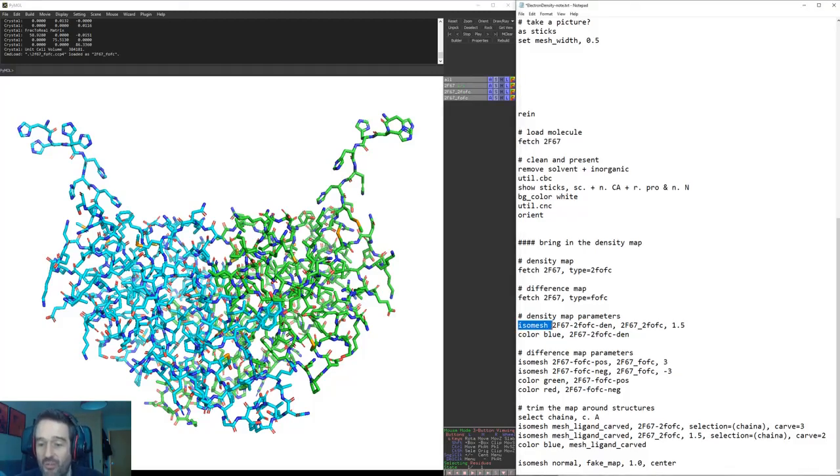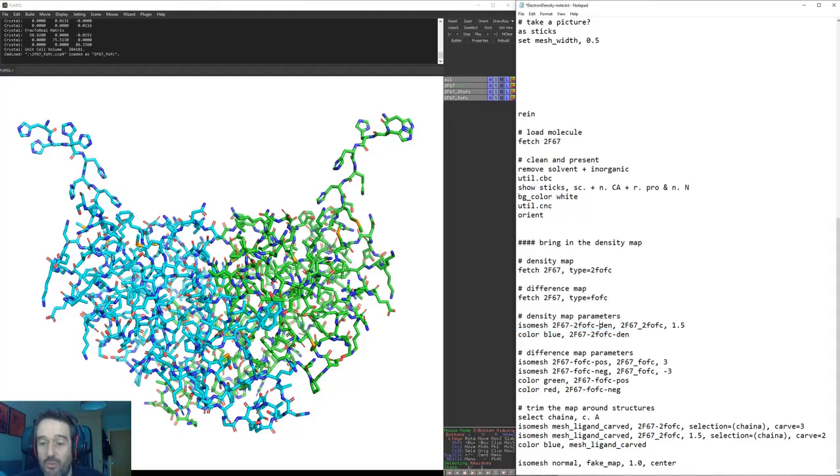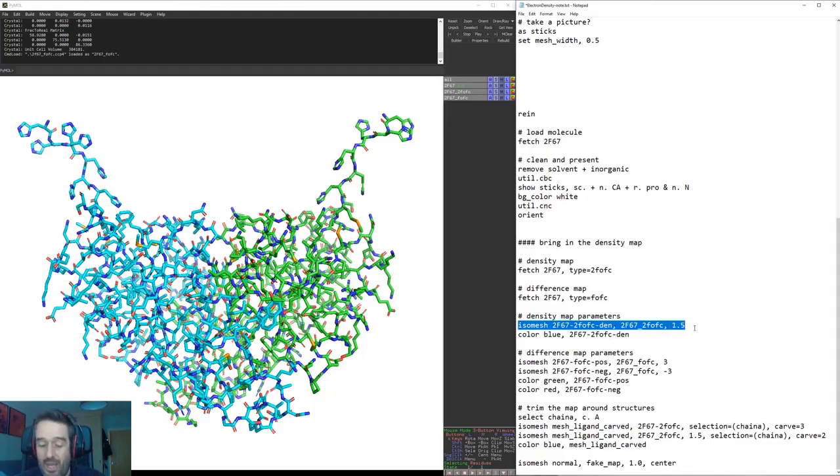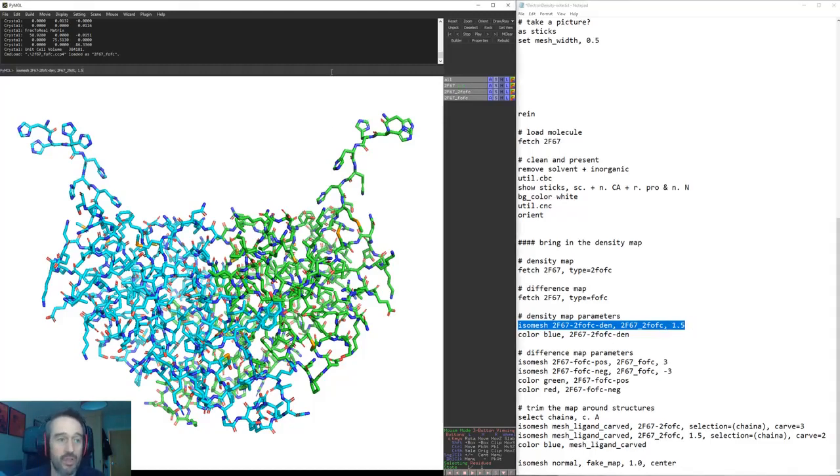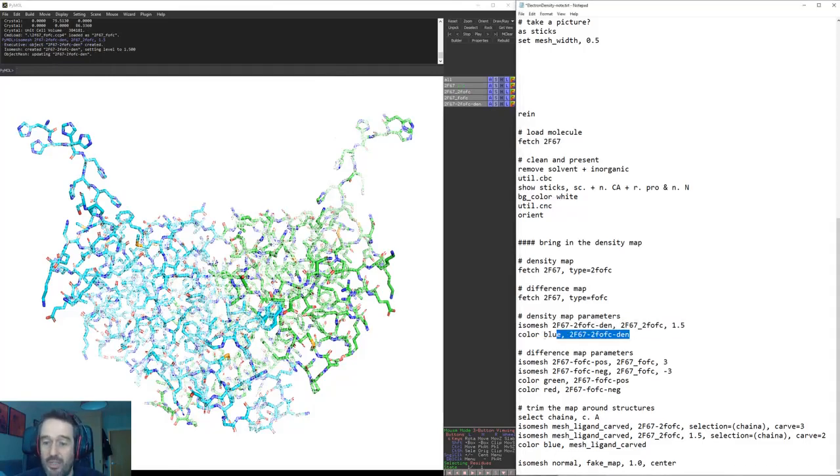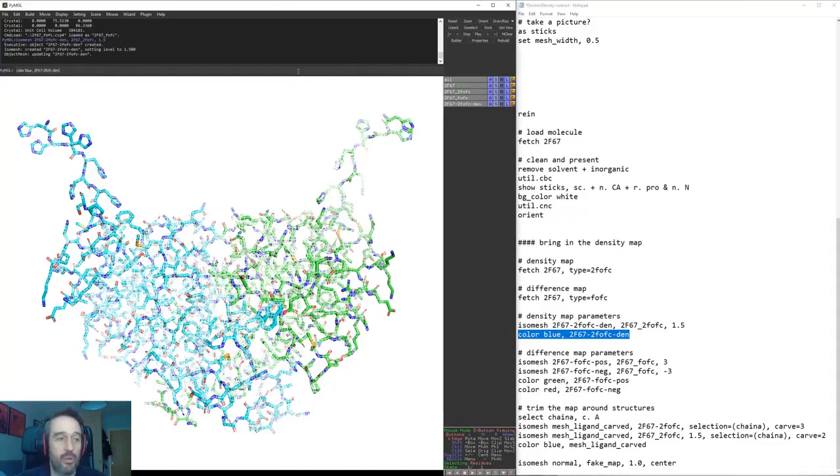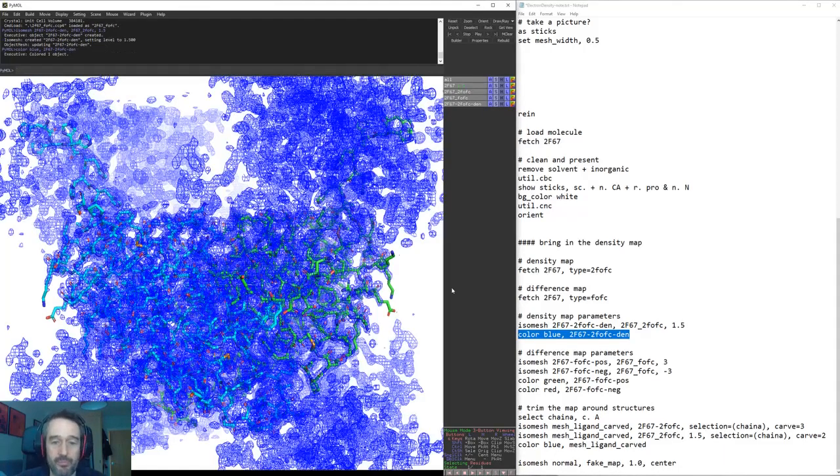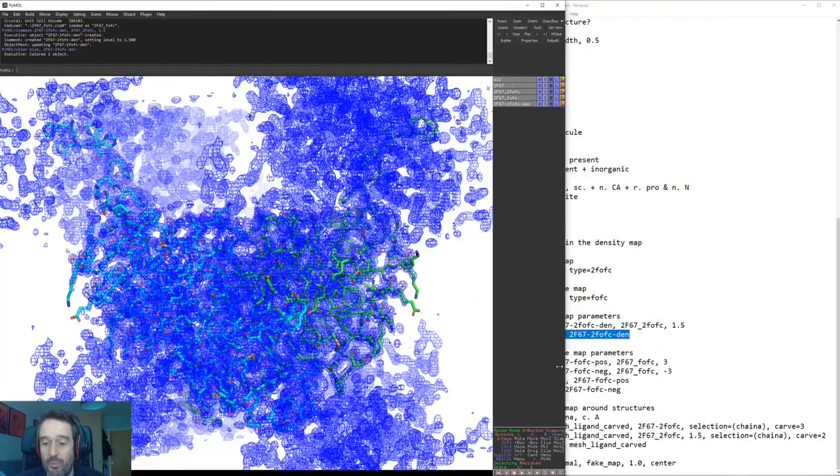So we've brought in our two density maps but they don't really show anything until we put a mesh on them or a surface or whatever we want. Isomesh is just a way of doing that. We say we're going to make a new object and we're calling it den for density, and this is going to be the 2FOFC map at a sigma value of 1.5. So we'll stick that in and there it comes in now as a white density, and again we're just going to then color that blue. And there's our map.